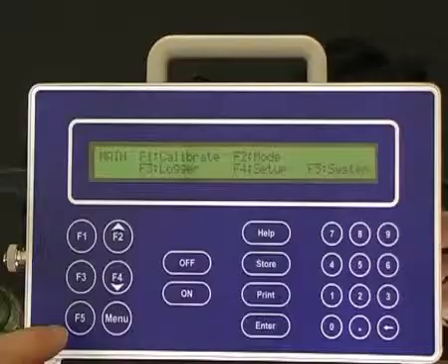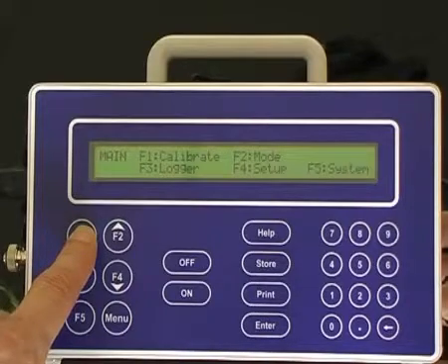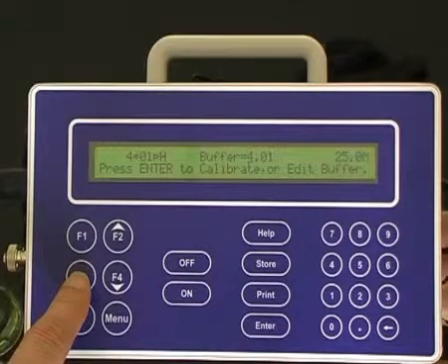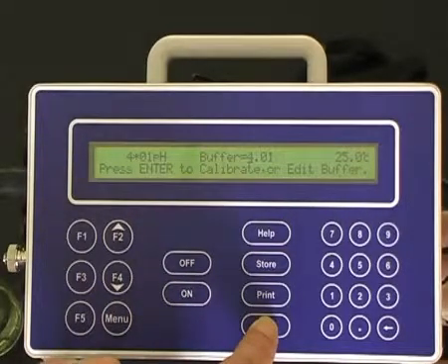Place the sensors in the solution. To calibrate the first point of pH, press F1 for calibrate, then F3 for pH. Once the pH measurement has equilibrated or settled, press Enter to calibrate for pH buffer 4.